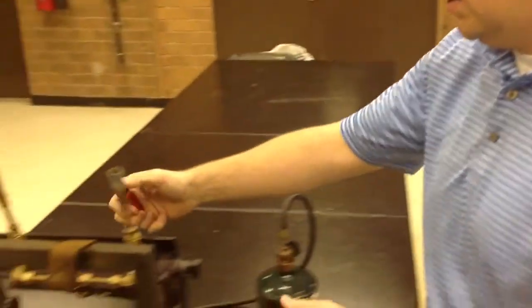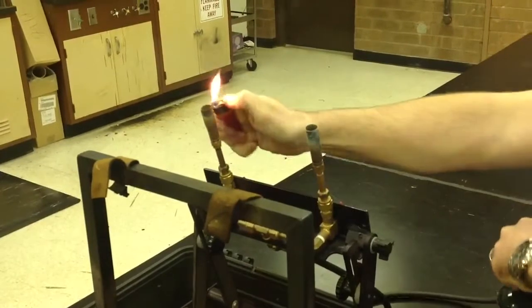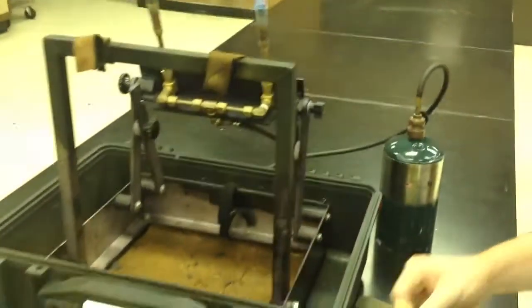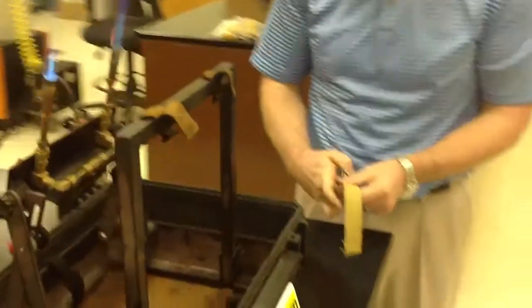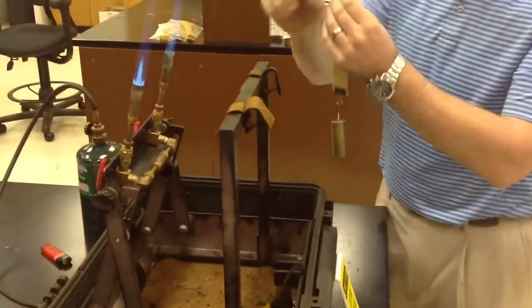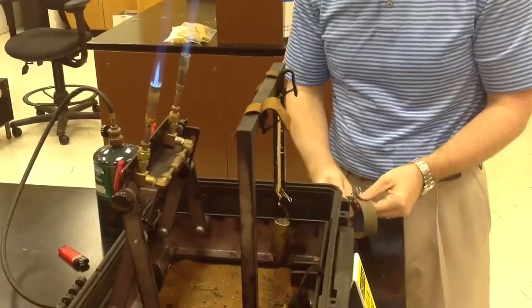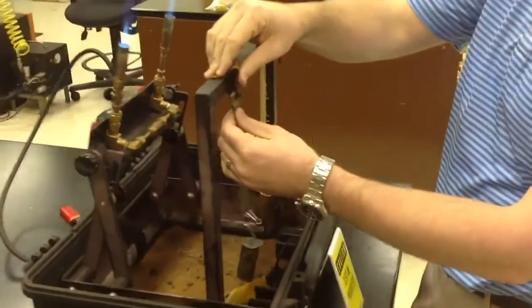So we'll get these burners lit and then we'll hang our samples in place. We have about a half-pound weight hanging from each sample to simulate stress on the garment during this flame exposure.